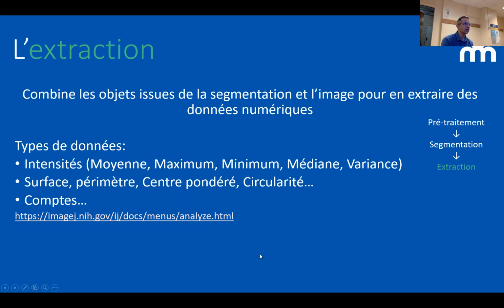How I usually do is I extract all of the data because it doesn't take too much space on your hard disk to extract everything. And then we have statistical models to analyze multiple variables at the same time. So when you don't know what to look at, it's sometimes good to have all the data, and then you may narrow down afterwards.